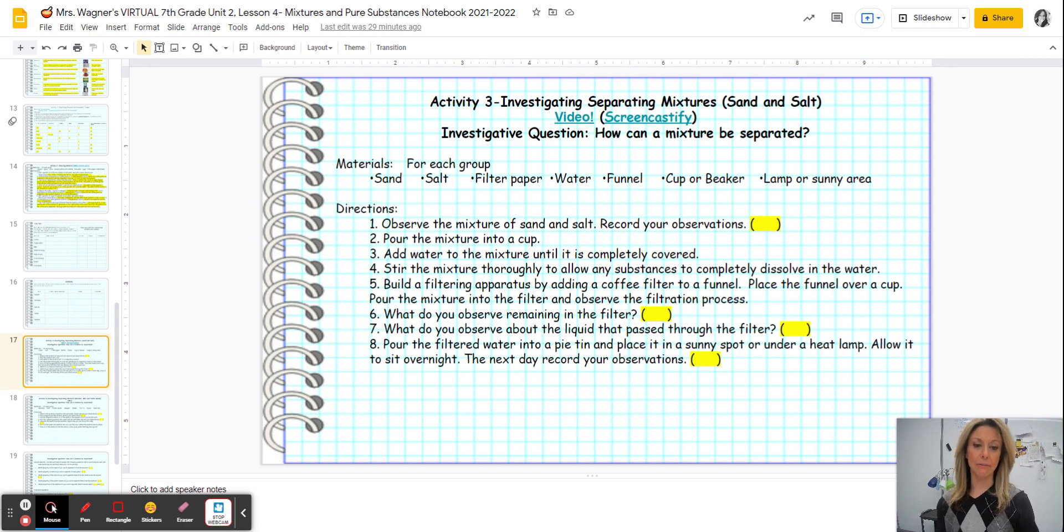This is 24 hours after we had filtered out the sand and we were left with the mixture of the salt and water in the beaker. I had poured it into this pie tin and set it underneath, you can see that over there, back there, that lamp overnight.